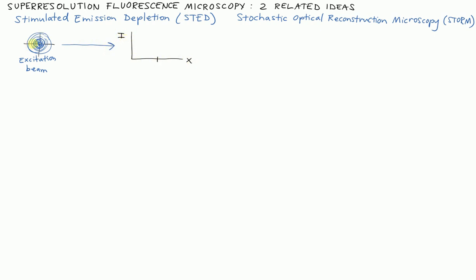So I do a cross section of how much of this intensity profile I might expect to see some fluorescence. I'll draw it in green, and it might look something like this. So there's my cut through of the fluorescence coming off, being excited by this blue light. It comes off as green light.